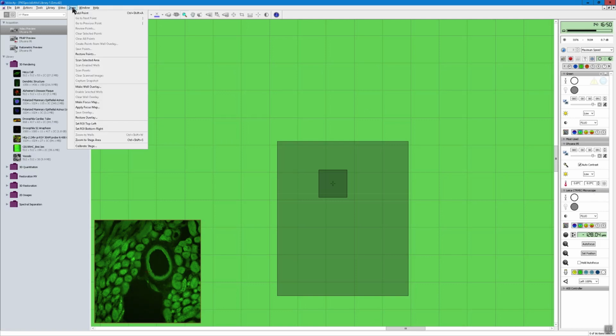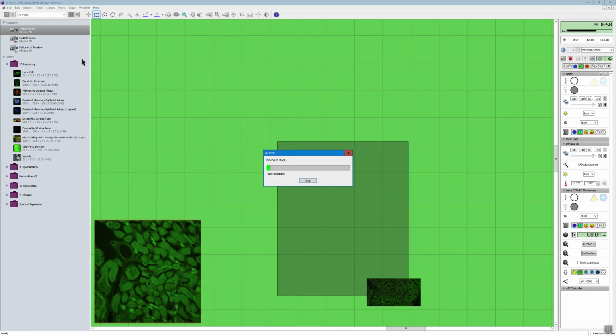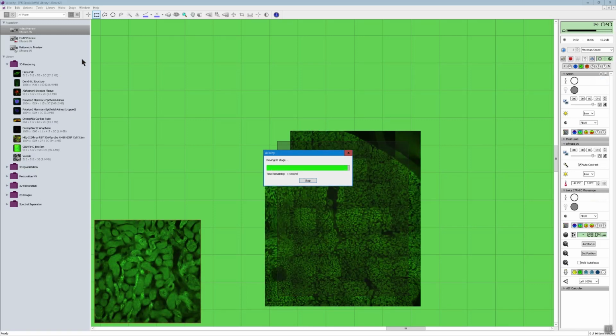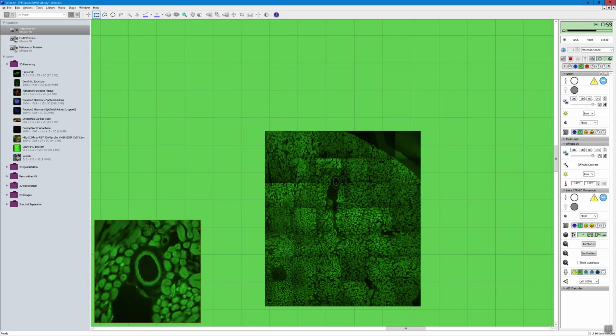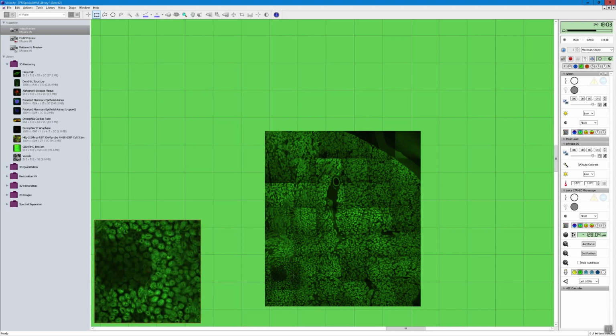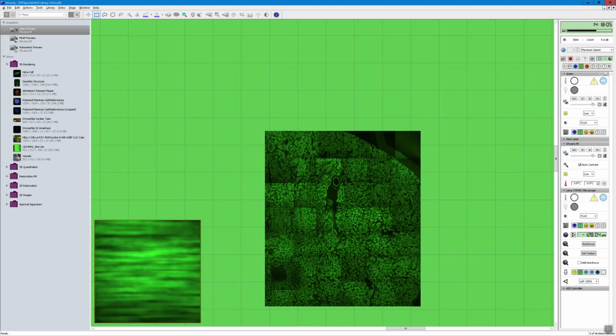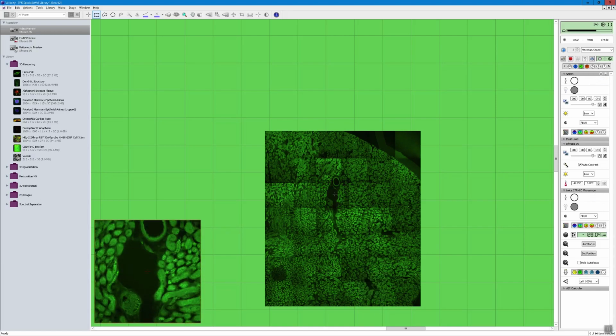You will note that this scan is a simple mosaic for reference rather than a fully stitched image, which, as I mentioned earlier, is an option in the Volocity acquisition menu. This can be done at a low magnification, and the resulting map can be utilized when working with high magnification objectives. Once the scan is complete, you can move around the scanned preview simply by double-clicking at any point in the stage preview as shown here.